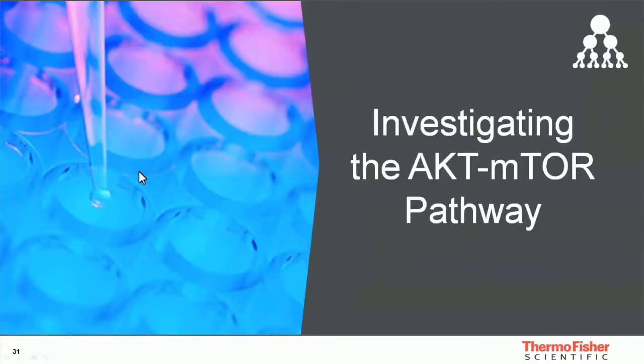Okay, so far we have seen how we can validate the antibody using the IP-MS approach. Now we wanted to put this into proof of concept to show how we can use this optimized IP-MS workflow to investigate AKT-mTOR pathway targets.